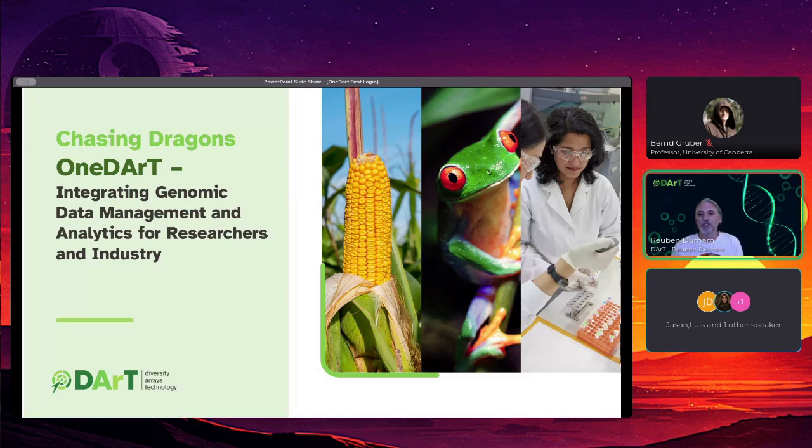We're very excited to show you a new development here at DArT, which is the OneDART Engagement Hub and its associated applications.